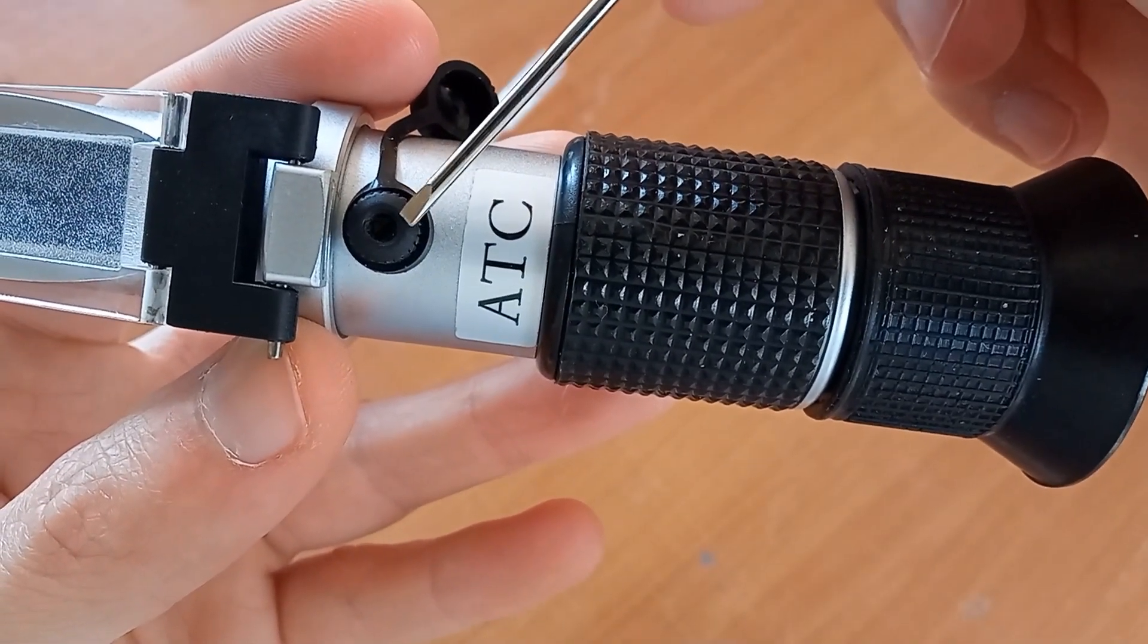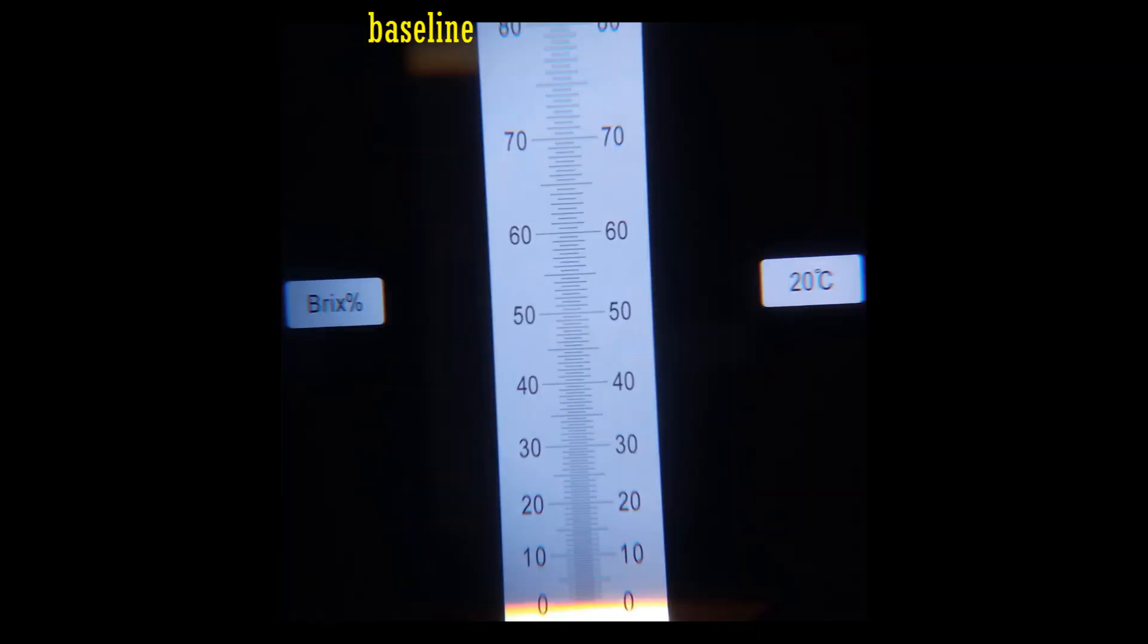This guarantees stability of measurements from 20 to 30°C. In fact, as you can see, water at 23°C gives zero BRIX.